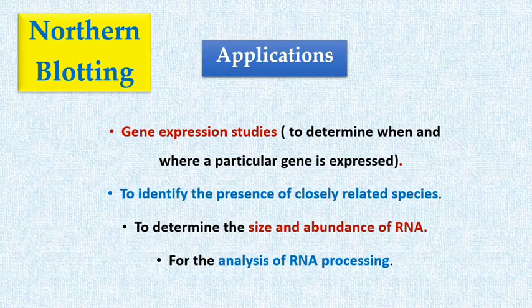This is because PCR and PCR-based techniques are simpler, quicker and more precise in nature.